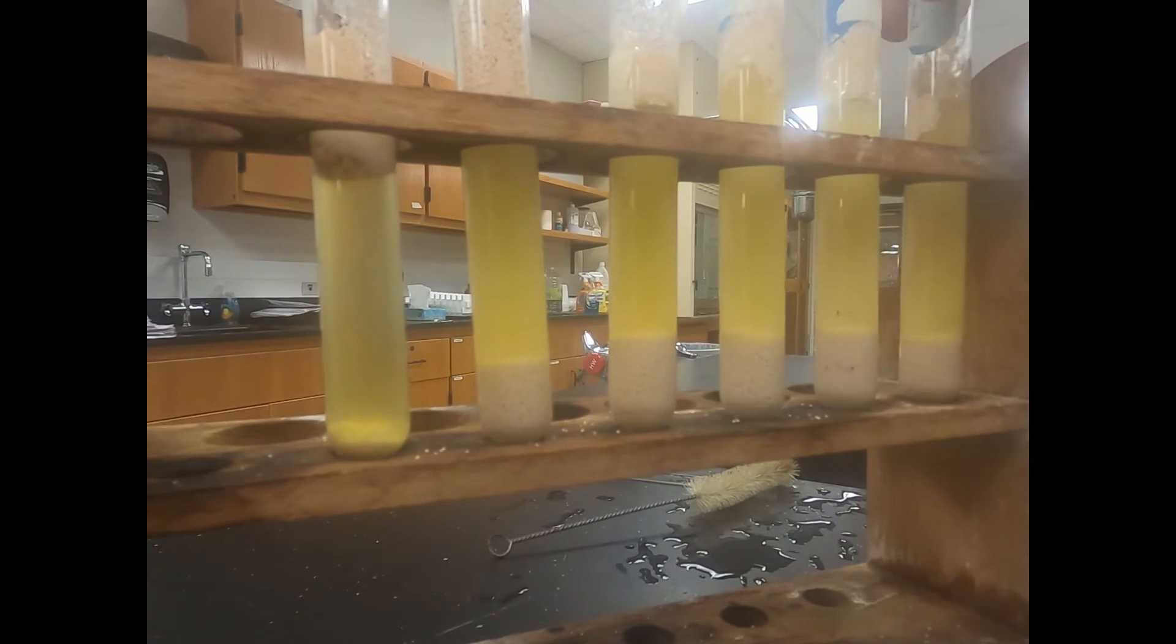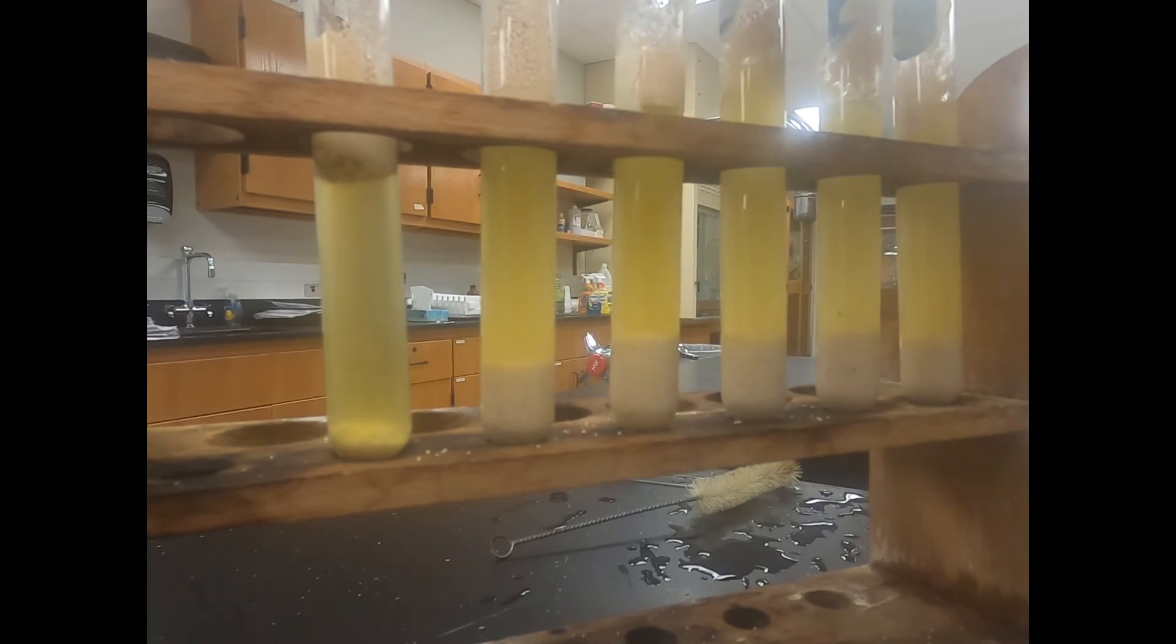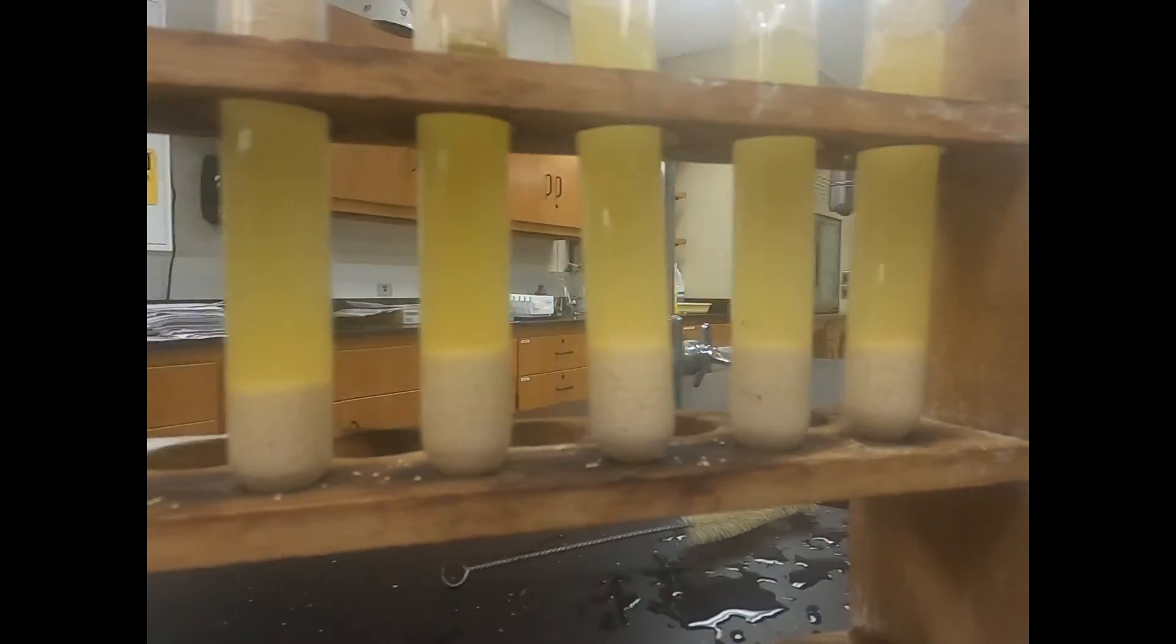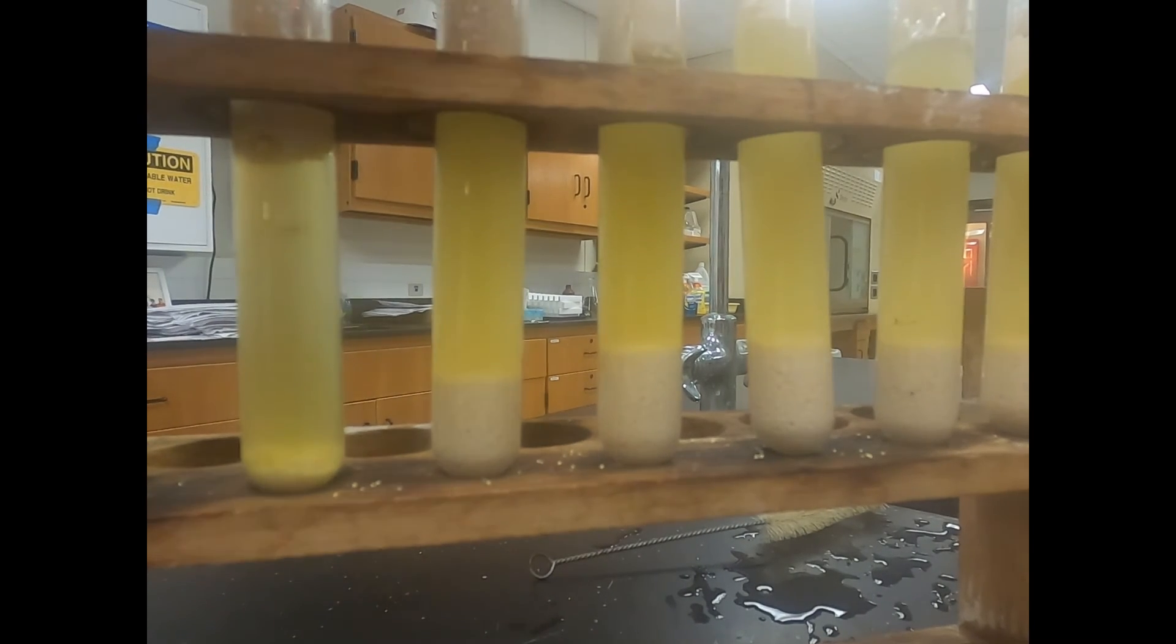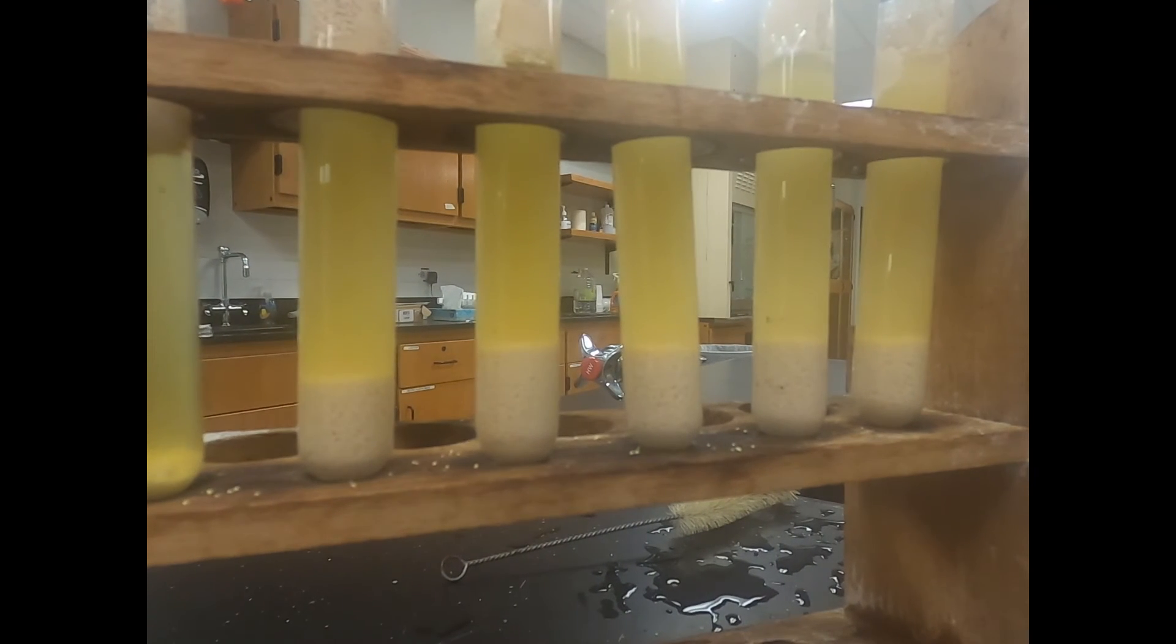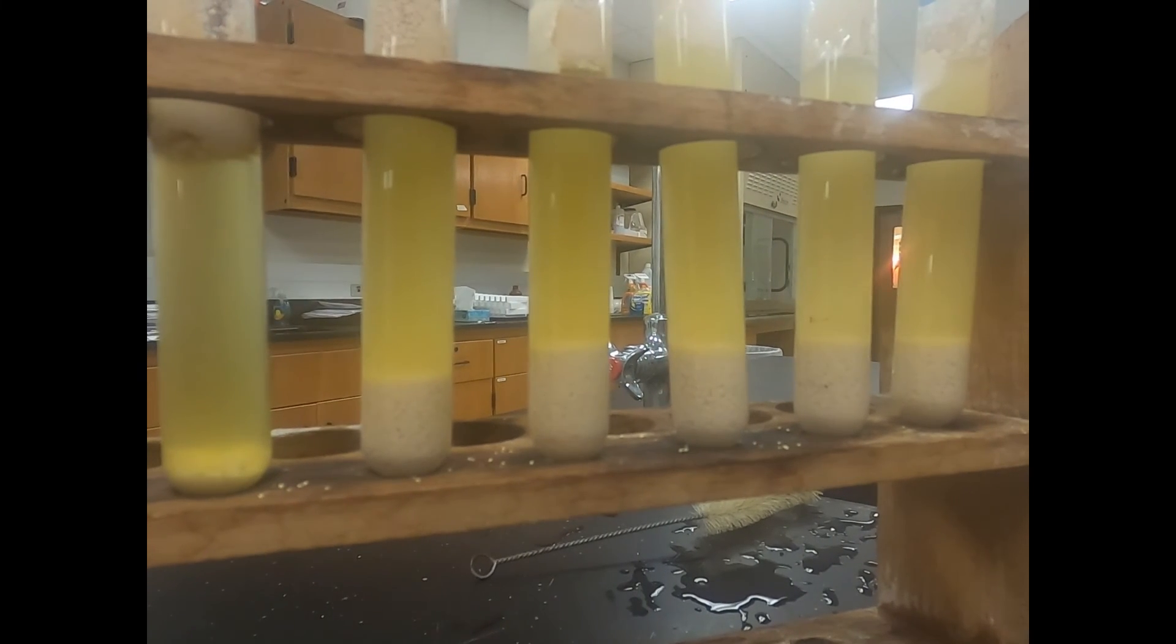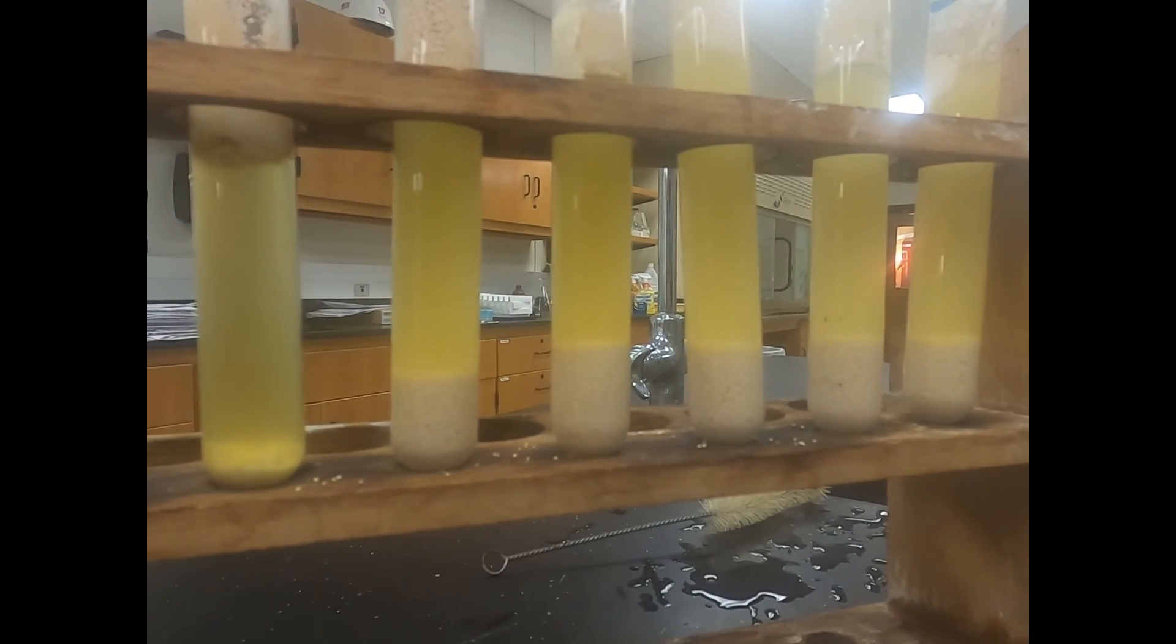It's actually a different hue of yellow as we go farther down versus the beginning where it's only got five drops, ten drops, fifteen, twenty, and twenty-five drops. Hopefully you were able to see as we progress from zero drops to twenty-five, we had more cell respiration going on with the more glucose available or the more sugar available. We were able to have more of that respiration take place creating more carbon dioxide.